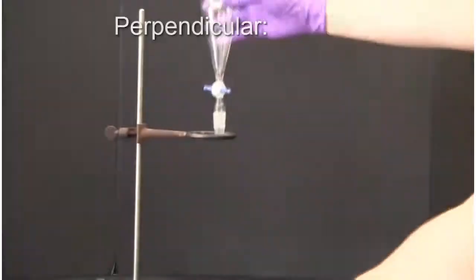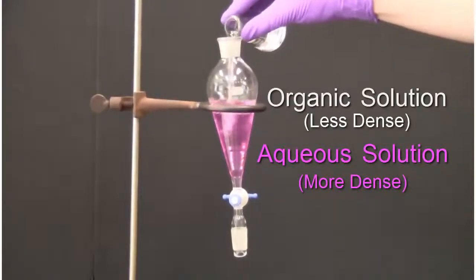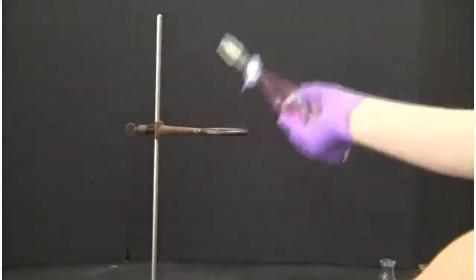To perform an extraction, we will be using a separatory funnel. This technique allows us to separate the aqueous layer from the organic layer.